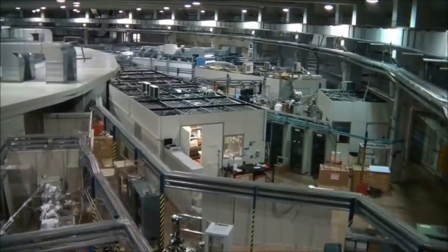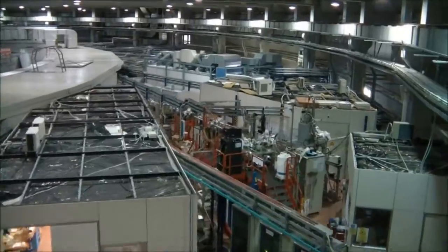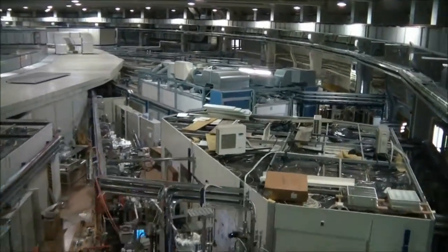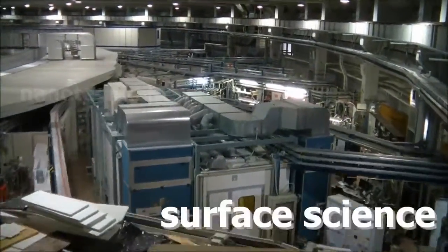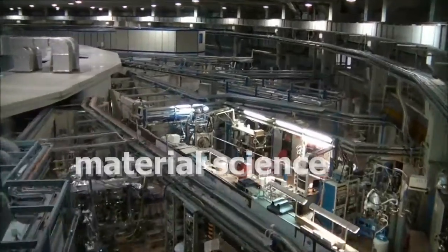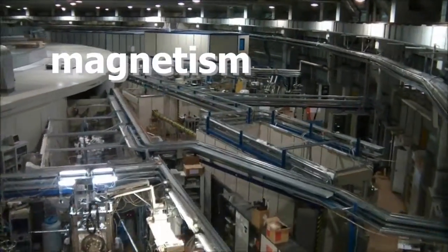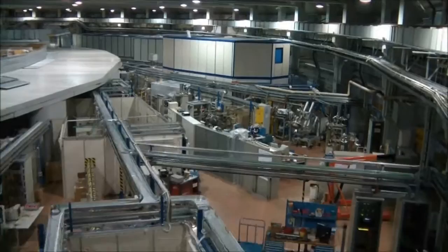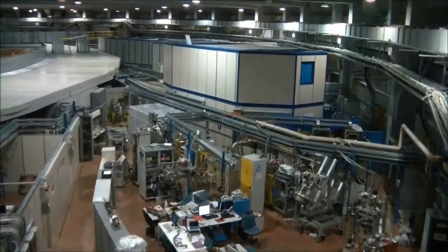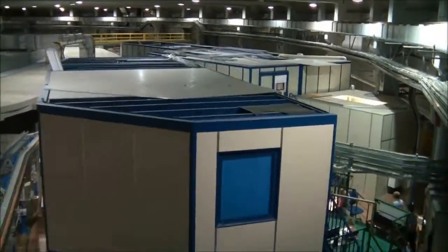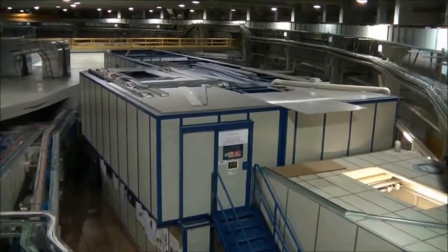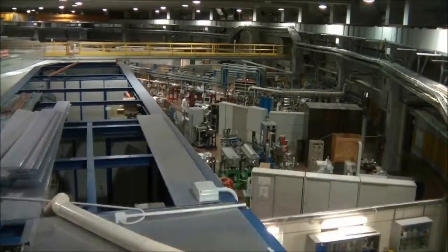The beamline welcomes a heterogeneous community of researchers from diverse fields such as nanotechnology, surface science and chemistry, material science and magnetism in particular. In 10 years, about 150 proposals for experiments have been approved and carried out, producing top-tier publications in international peer-reviewed journals.